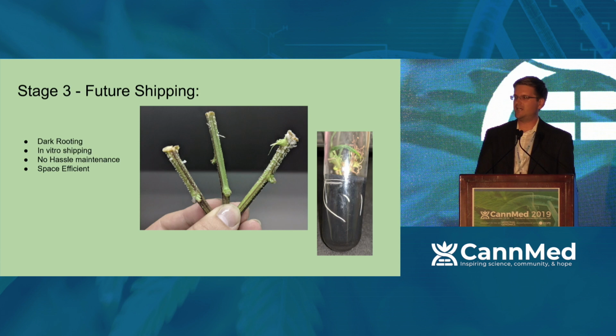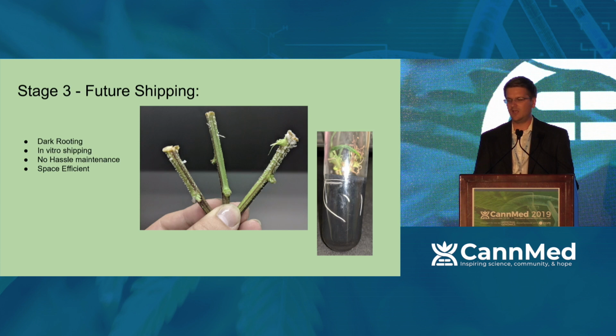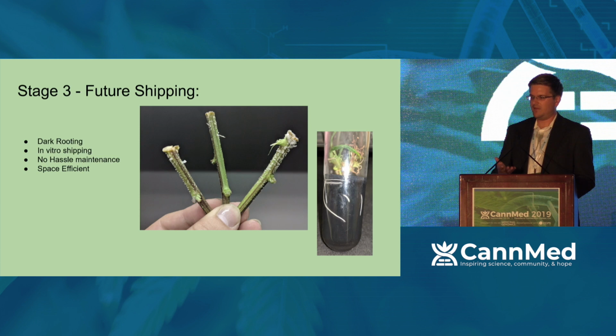A week later, I just wanted to check, see if it had started molding or whatnot, opened it up, and there were roots all over the lower part of the plant, right where the callus or the undifferentiated cells really would have appeared. You can start to see those white little dots. Those are all root starts. And so I gave it a shot in tissue culture. Why not try it in vitro if it works ex vitro?